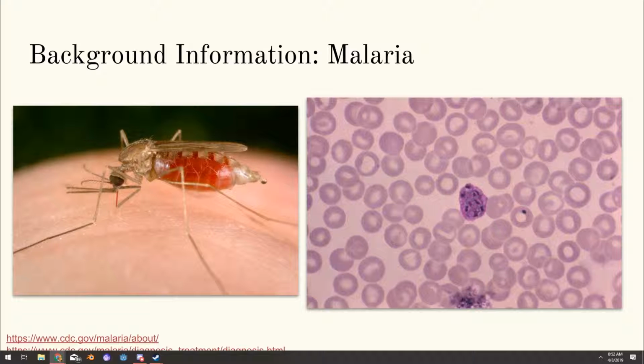One way of detecting malaria is to examine a drop of the patient's blood on a slide under a microscope, known as a blood smear. That's what the image on the right is that you were looking at. Usually the blood will be stained to make the parasite more visible. The slide is inspected by a laboratorian, but the accuracy depends on the quality of the reagents used to stain the parasite, the microscope, and the experience of said laboratorian. The goal of this program is to remove the experience part from the variables and to create more consistent results.